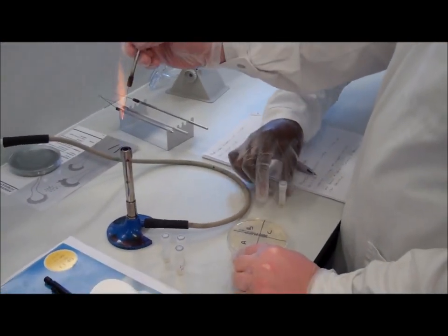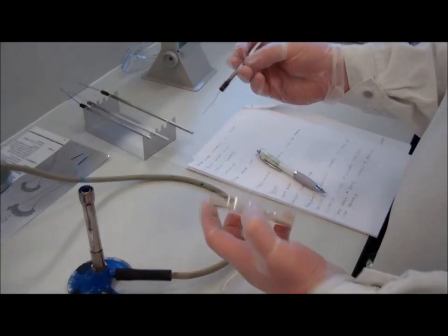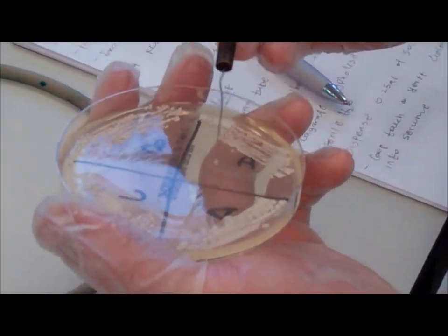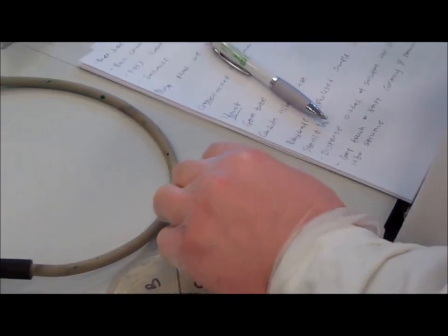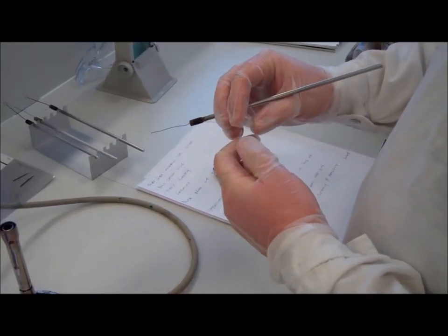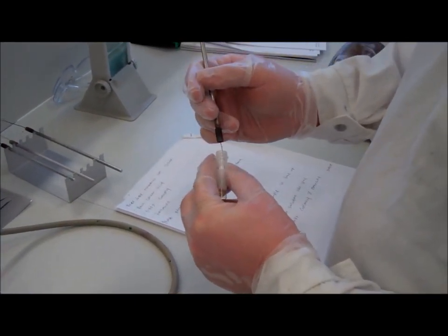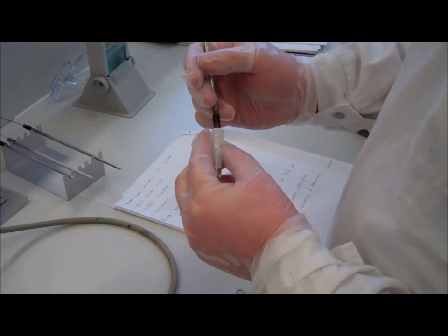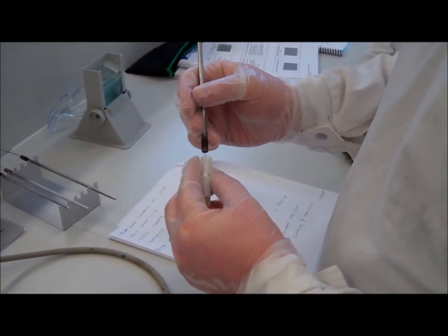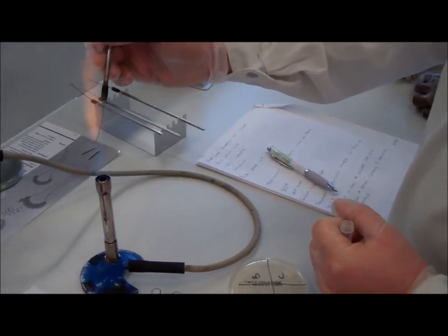Firstly, the straight wire is flamed, then a colony from the agar plate is transferred into the serum in the test tube. The colony is suspended in the serum. The test tube is then ready for incubation at 35 degrees centigrade for 2 to 3 hours.